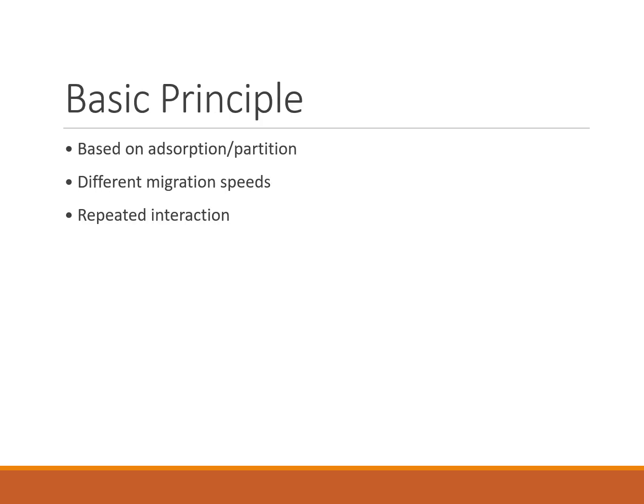The basic principle of chromatography is based on adsorption or partition types. Some components of the mixture interact strongly with the stationary phase, while others interact more with the mobile phase. So each component moves with a different velocity, leading to separation.